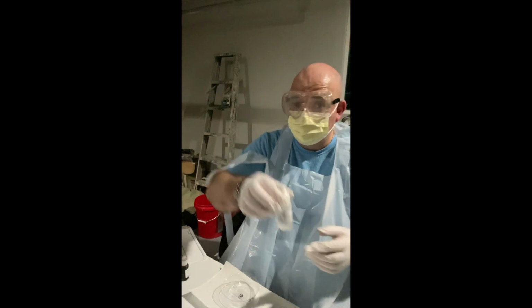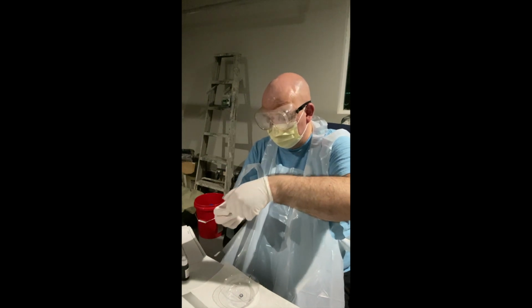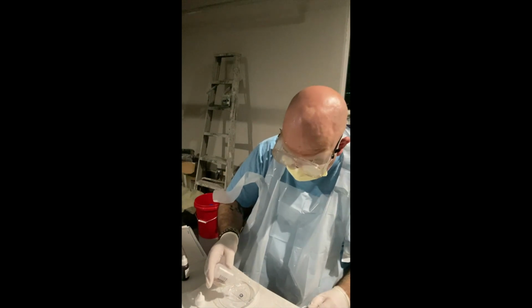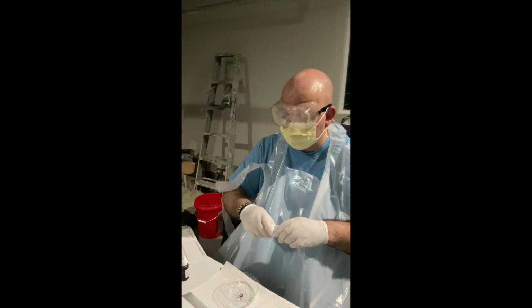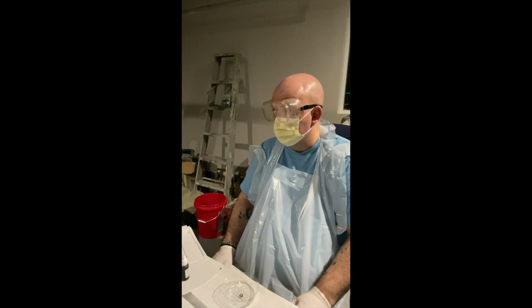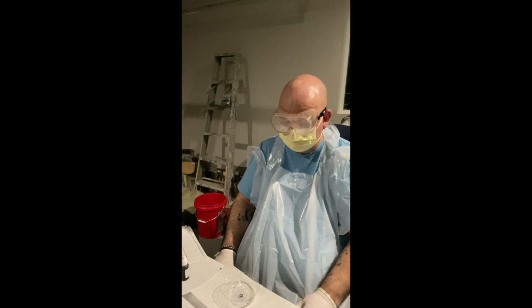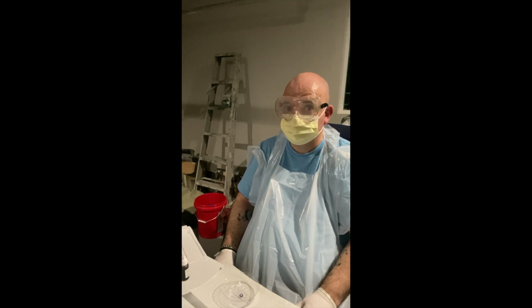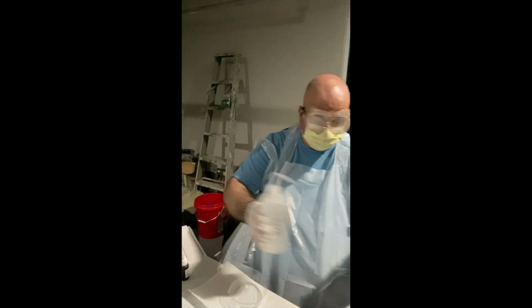So next one is the decolorizer. This is 2 to 3 drops. Okay, that's 3 drops. No real viscosity to this, and we're going to wait 30 seconds. And then I'm going to rinse it again. Okay, it's been 30 seconds. Tap water and some rinse.